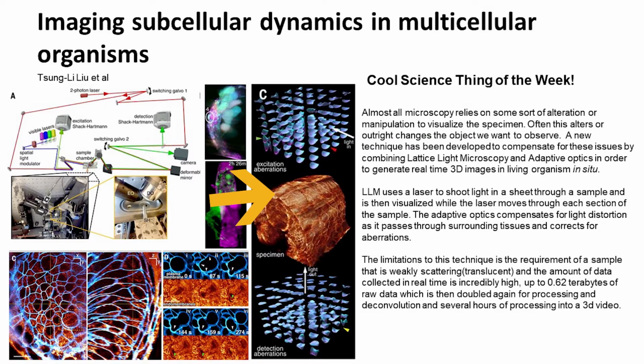And the reason why it's so cool is because it can visualize multiple different colors at the same time, so different fluorescences. So here we can see a zebrafish eye, we can see tight junctions, as well as I believe those are stained for the rods on the membranes, which is actually really, really neat. This little purple picture here, that's a blood vessel, and the green stuff is a tumor actually infiltrating out of the blood vessel. So that's actually really cool. And the multicolored image here is a neural crest from a zebrafish, which is actually very, very neat to see and not something that we can typically see in real time. We can actually visualize it on here.